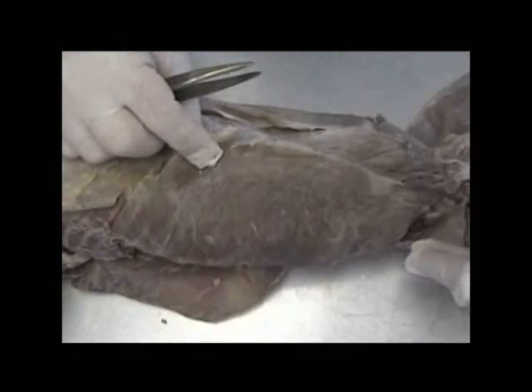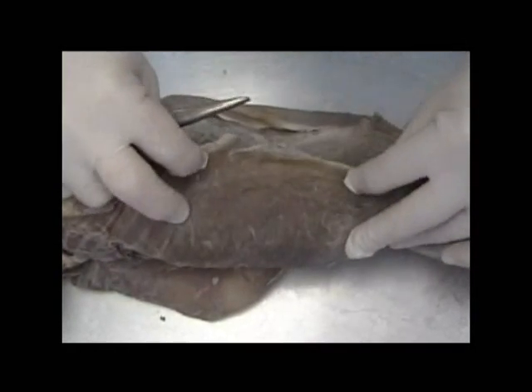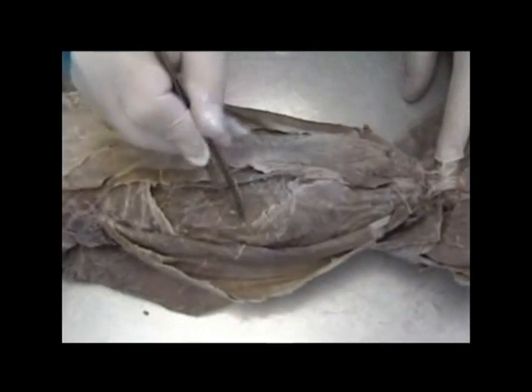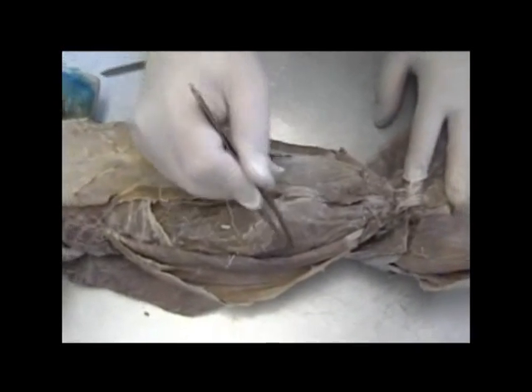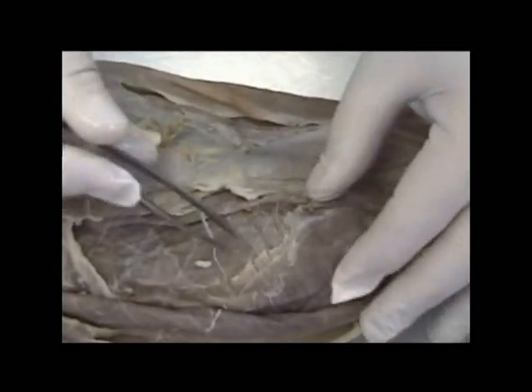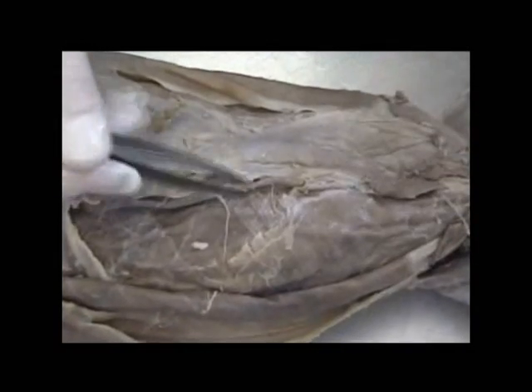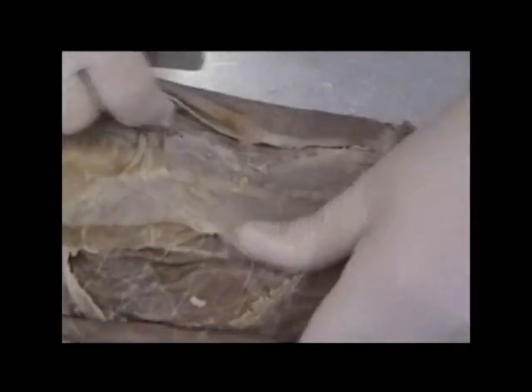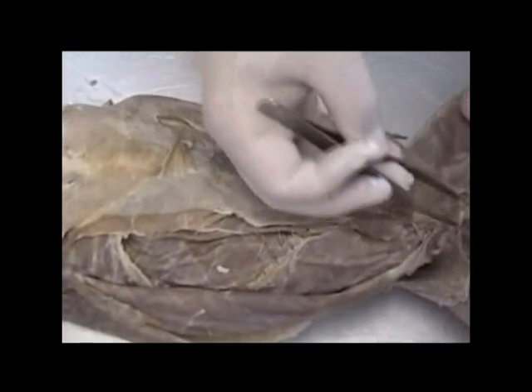External oblique, rather large muscle coming off the side and running toward the medial portion of the animal. We peel that back, and there are two other sets of abdominal muscles. One you see whose fibers run this way, and this is the edge of the muscle running around like this. This is the internal oblique, and it usually sticks closely to the muscle underneath it, whose fibers, although you can see here, are running this way. And this is the transverse abdominis. So external oblique, internal oblique, transverse abdominis.